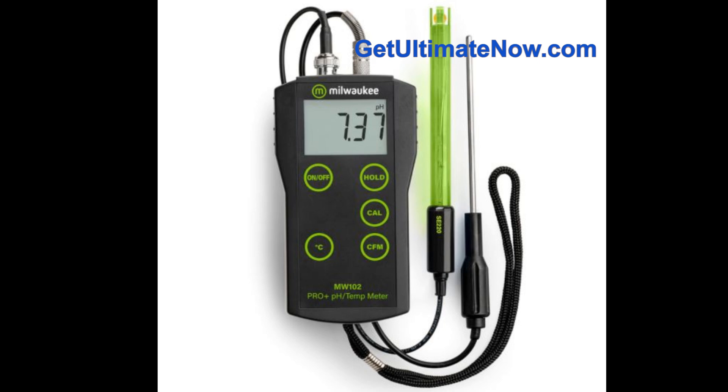The MA9919B1 wine electrode is specifically designed for measuring pH in wine. Wine can be pretty acidic and often contains particles that can clog a regular probe, but this specialized electrode is built to withstand those conditions and provide accurate readings even in their presence. It's like a heavy-duty probe for serious winemakers, designed to thrive in that environment.